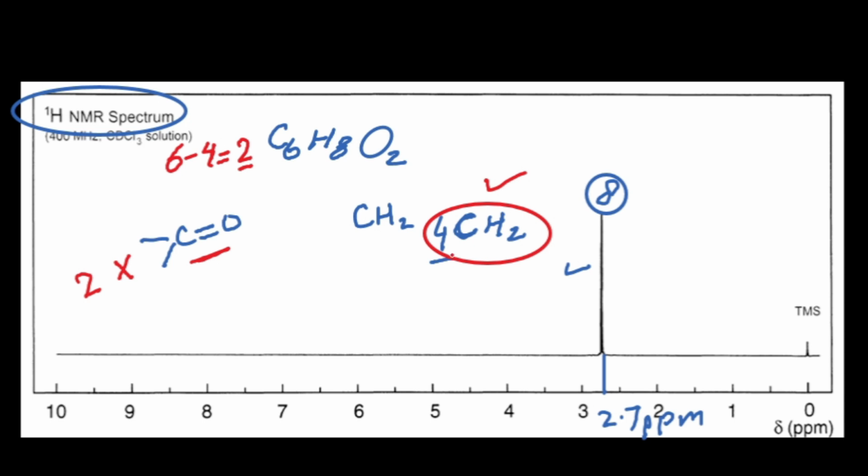Okay, if you see here the CH2 group is present, it means no CH3 group is present. So to satisfy the valency of the carbon, it should be in ring form. As you may see here, 6 carbons are present, so you may make a ring with the 6 carbons. So this is the ring with 6 carbons, and the 4 CH2 groups should be of the same chemical environment.